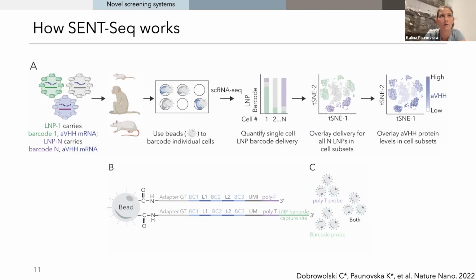So we had to do a lot of improvisation on the molecular biology side of things and the computational side of things. So it felt like the best proof of concept to us. And so we adopted a single cell RNA sequencing method, which was recently published in Cell, known as microwell. And since then, BD has created a system that takes this and puts it into a kit, and that system is called Rhapsody. But we used microwell for the purposes of this paper.